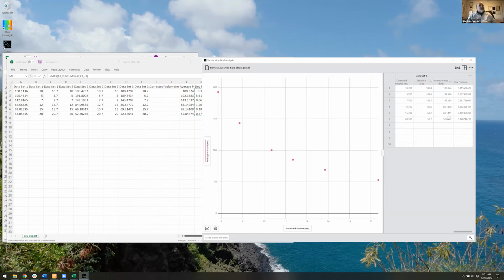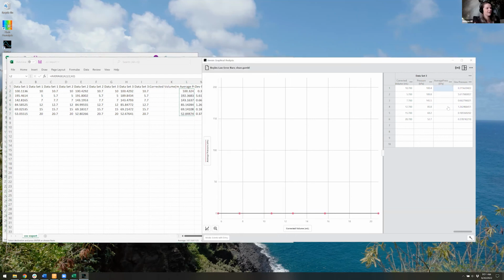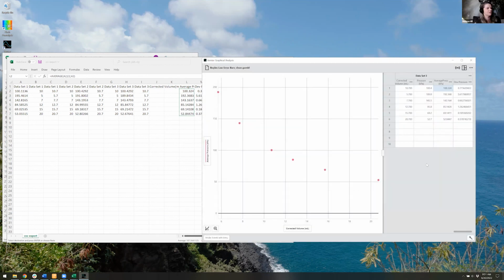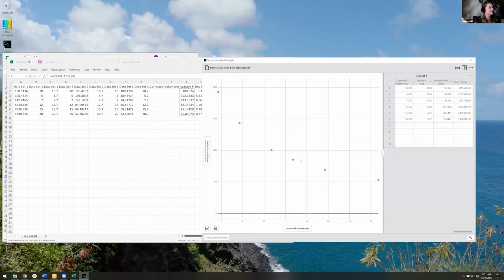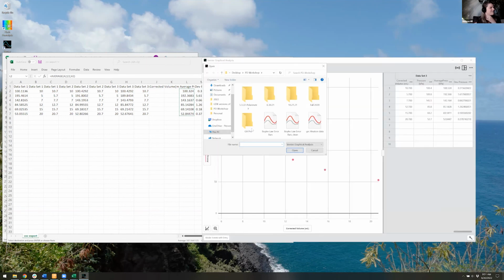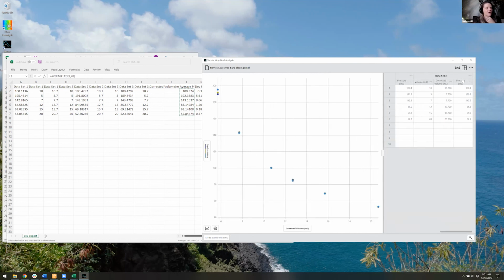It also didn't copy right. Let me just delete this again and make sure it's copying right. I mean, it worked great yesterday when we were trying. I know, hate when this happens, especially when you're demonstrating it. Okay, let's see. I don't know what's happening. Well, you know what? Let's just do it again. I hope it doesn't have something to do with the fact that when I made this file, I deleted some things and maybe there's a weird bug.